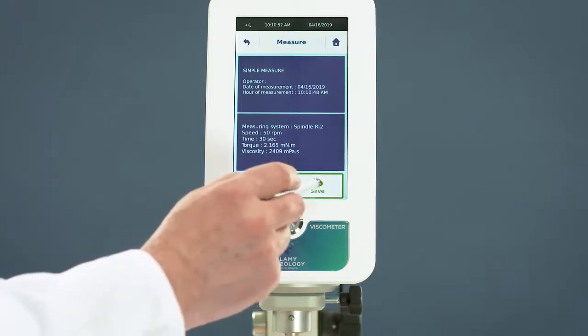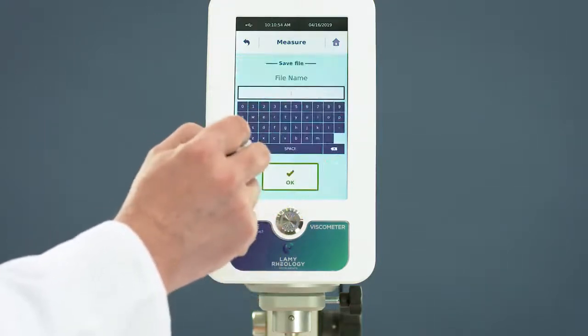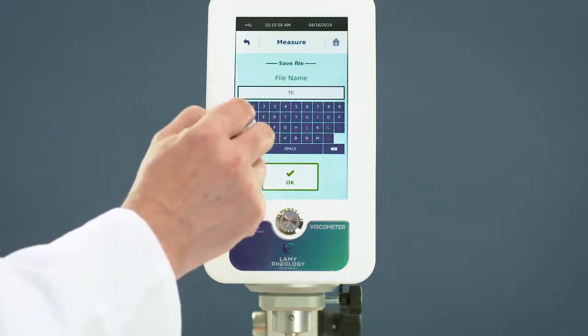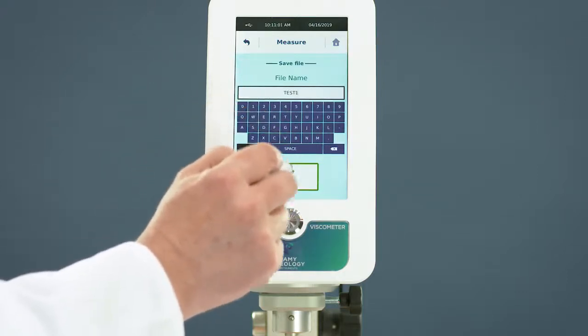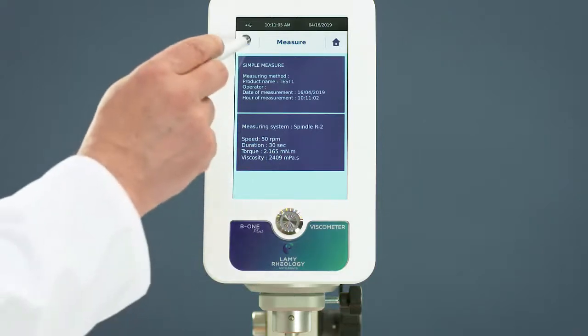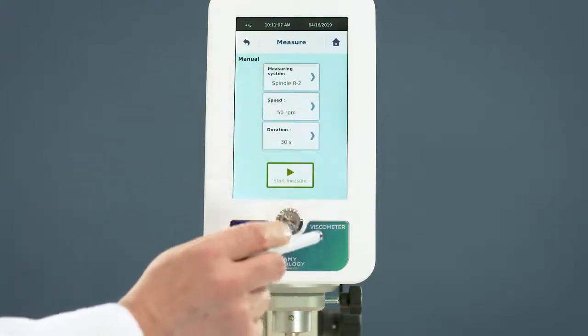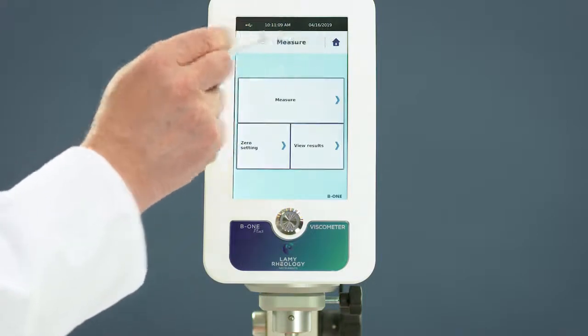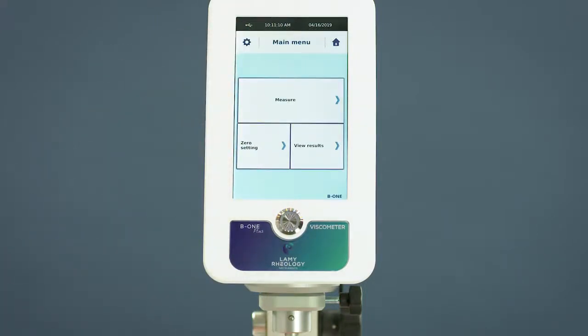After the test, you can save all data in the device's memory to be read or exported later. As you can see, measurement with the B1 Plus is so easy.